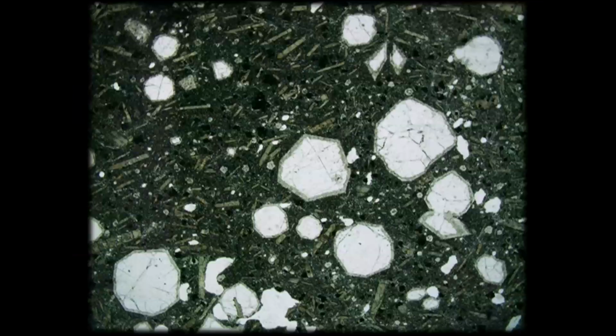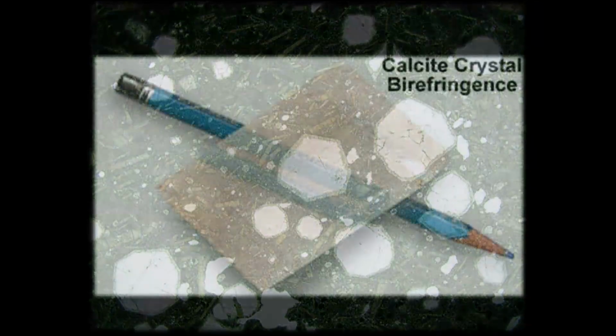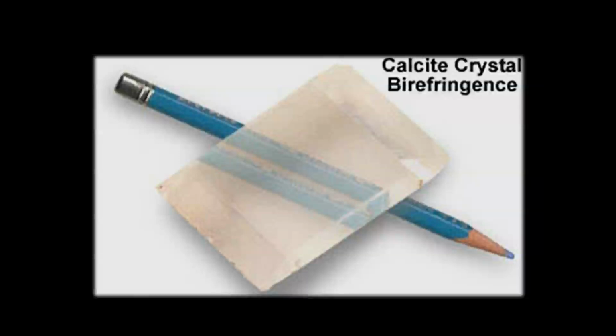An anisotropic substance is such where the different faces have different axes. So let's take an example. In isotropic substances, when light enters, it will get refracted in a similar manner from each of the faces. But in an anisotropic substance, where there are some changes in each of the faces, the refraction will not be similar from each face. Now, this can be utilized in biology.